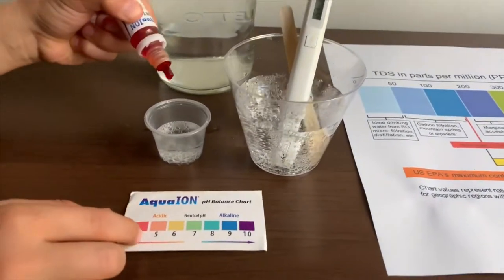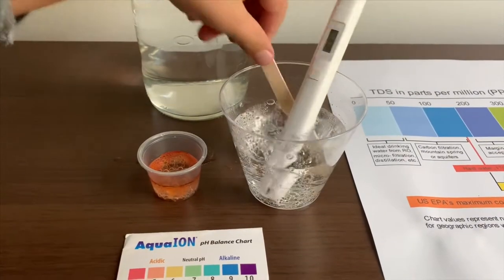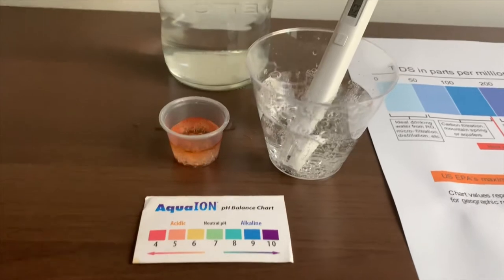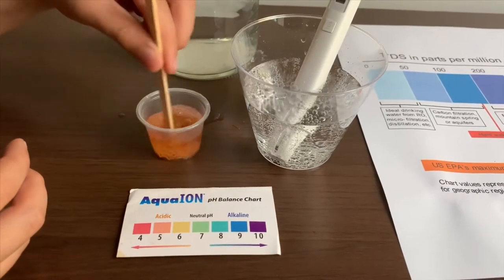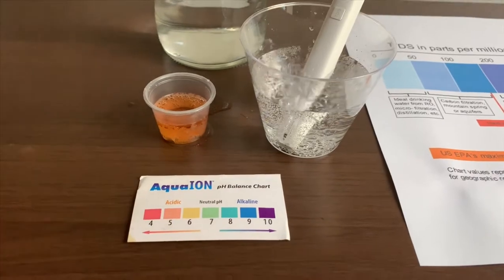Now let's test the pH level. Only two drops. I give this a 5.5 — this is acidic.